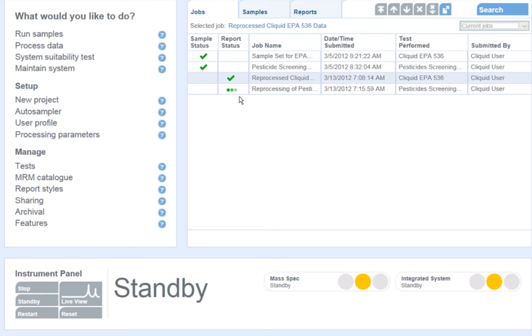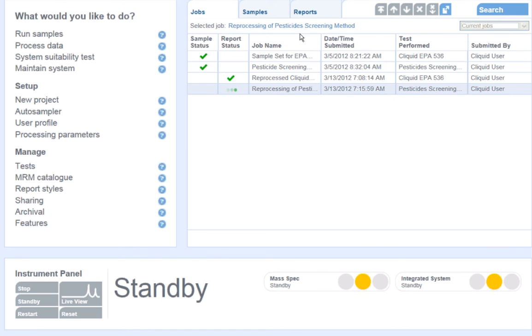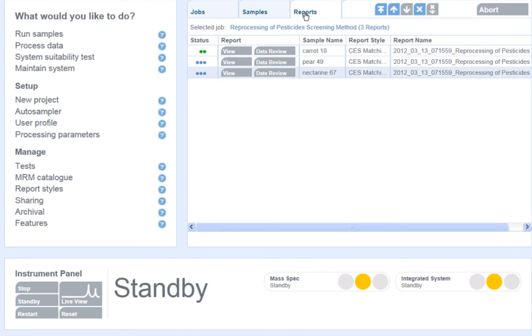The software takes me back to the home screen where I can watch a trio of blue dots cycle to green as my data is being processed. I can highlight the job and go to the reports tab to watch the report generation from this screen as well.